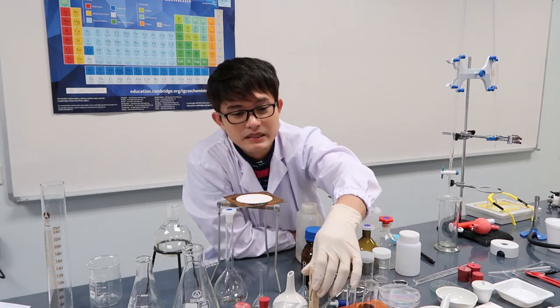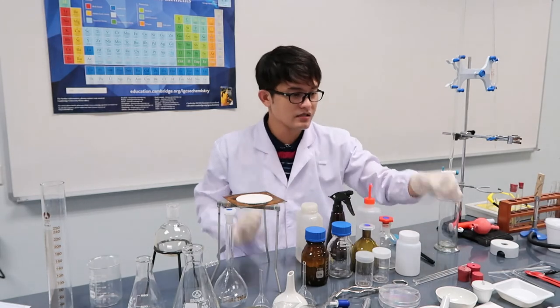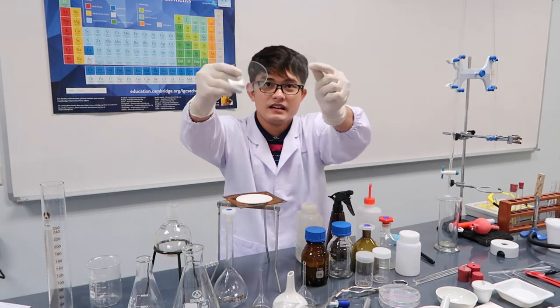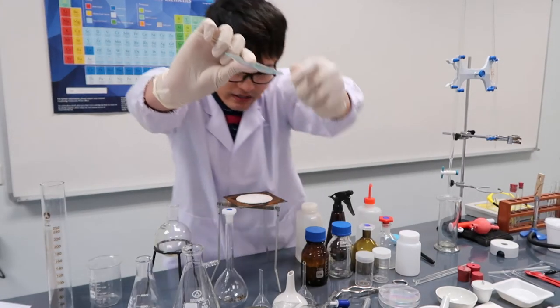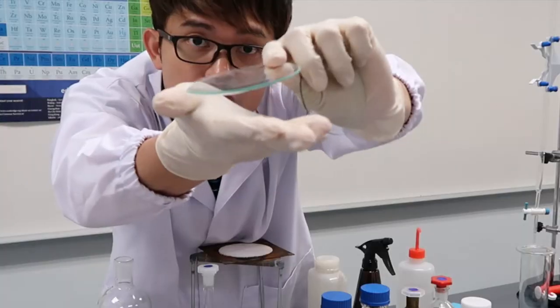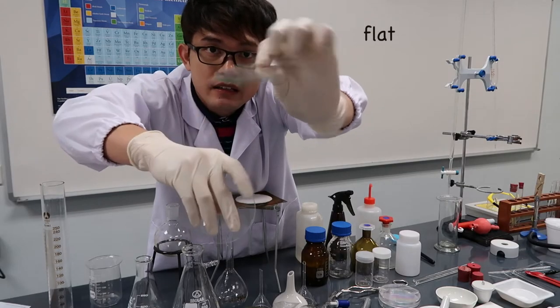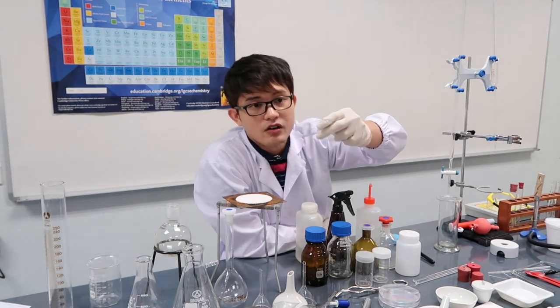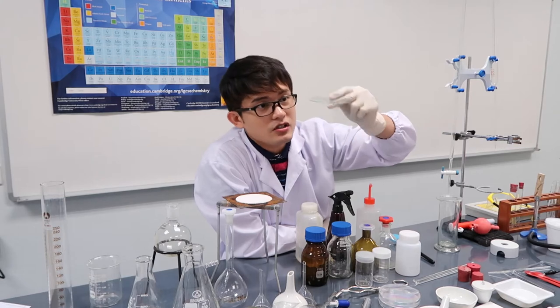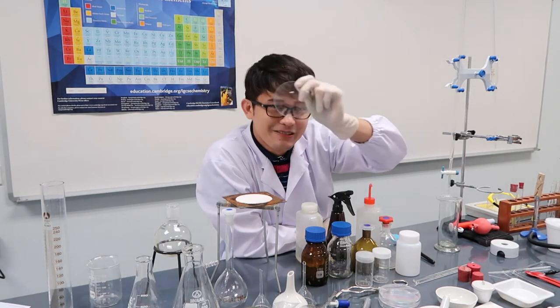This is a watch glass. It is concave in shape. You can put it in an oven and evaporate samples on it, so it's used for drying purposes. That's the watch glass.